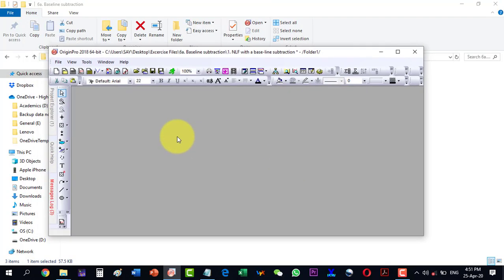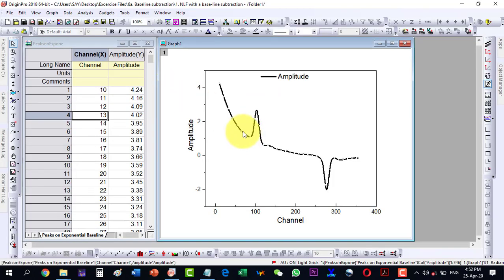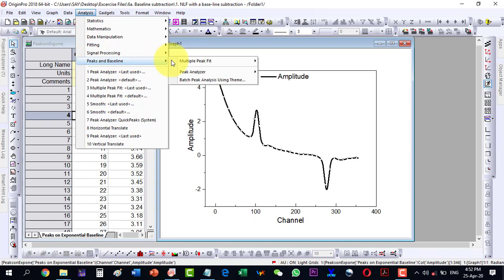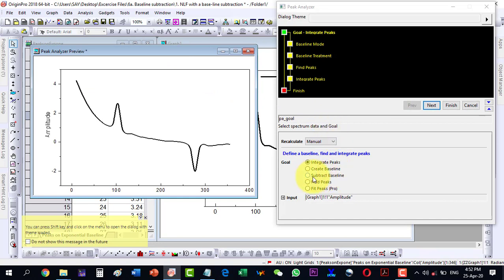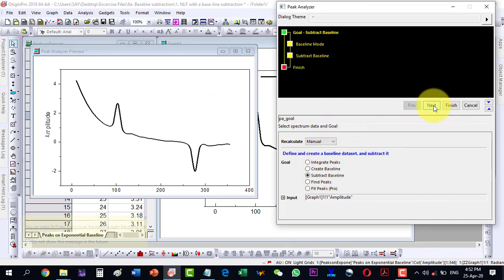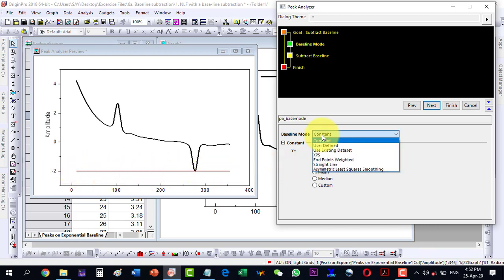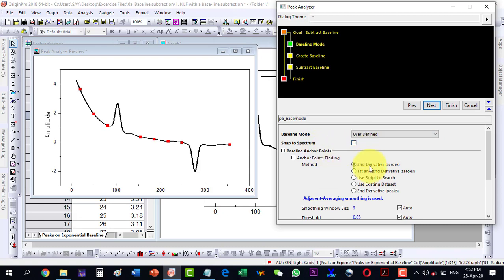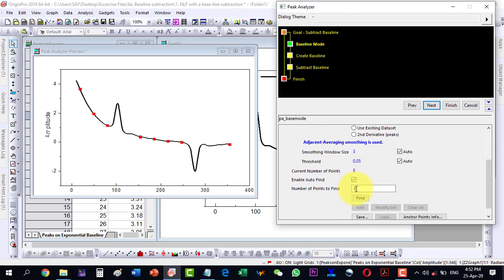A second method is to subtract the baseline directly without creating it separately. Select the plot, go to Analysis > Peaks and Baseline > Peak Analyzer > Open Dialog. This time select 'Subtract Baseline' and click Next. The baseline mode defaults to Constant, but we change it to User Defined, select Second Derivatives, and use Auto Find with 8 points.